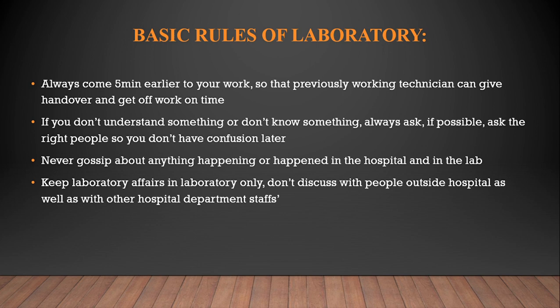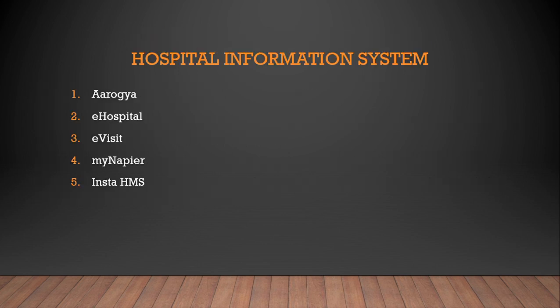As we all know, there are various types of software available in the market. Each laboratory may be using a different type of software to run their lab, and many of the smaller laboratories may not have any software, and they may be using Microsoft Word or Excel sheets to enter the values, take a printout and give it to the patient.